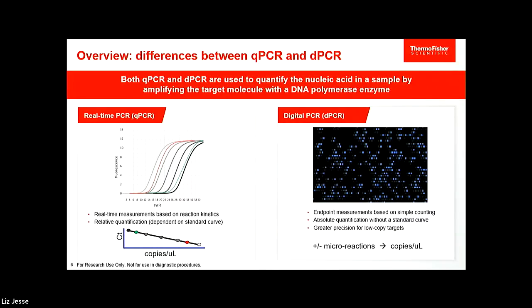You're starting with DNA, you're loading dNTPs, and your Taq polymerase. The differences start to rely, as we touched on earlier, is that real-time PCR is very reliant on the kinetics of the assay. It's important for us to be able to plot the amplification on a curve so that we can decide how these samples are relative to each other in their amplification. That makes us reliant on the kinetics and the efficiency of the assay.